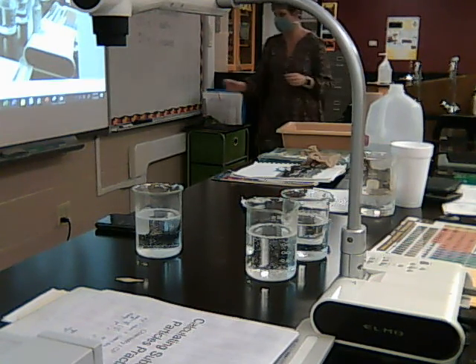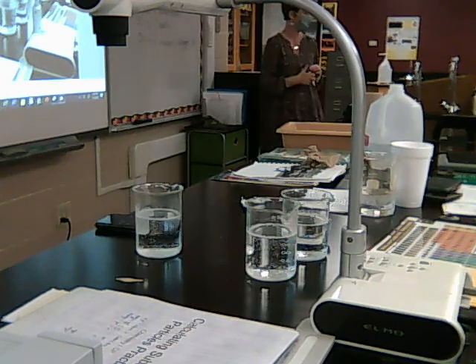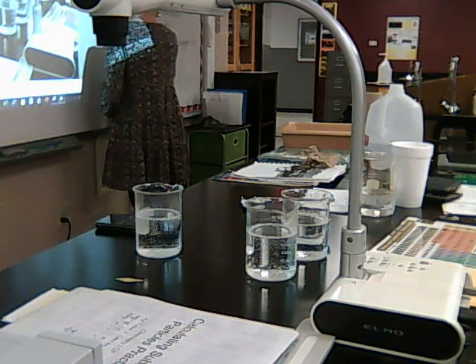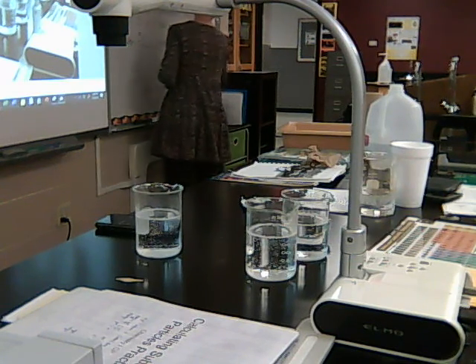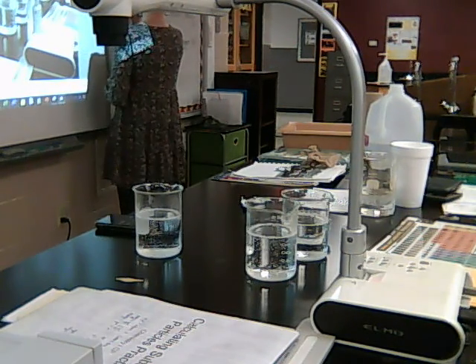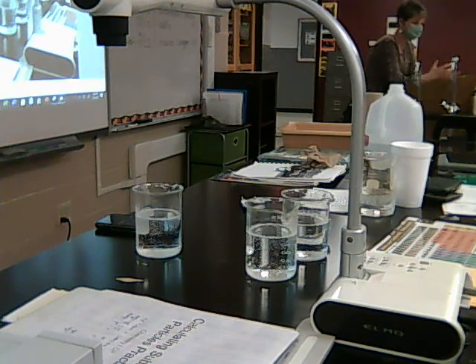The bigger the surface area, the faster the reaction, because we know that crushed tablet has a bigger surface area. So we see it took 51 seconds, which was faster. On the other hand, the whole tablet had a smaller surface area, and it took more time, which means it went slower, didn't it? And that's something students get confused about. They see that big number and think, oh, it's faster. But remember, more time means it was slower, right?